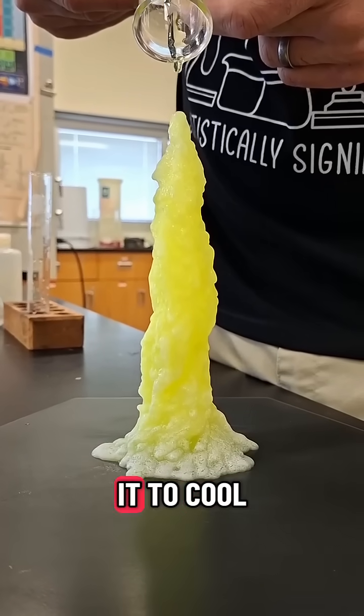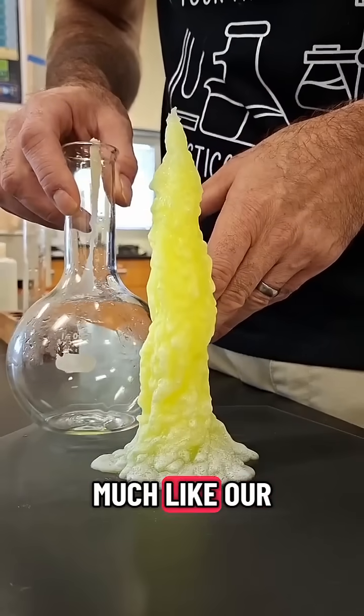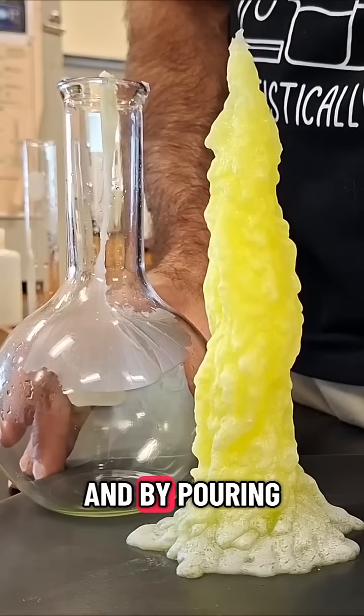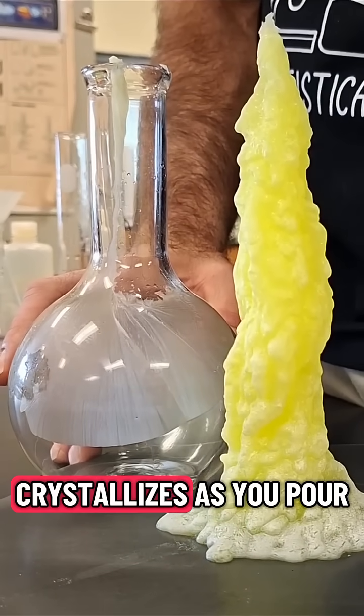And if you're even more careful, you can get it to cool down and stay a liquid. Fortunately for us, much like our membership-slinging friend from earlier, the solution is unstable like this, and by pouring it out onto some seed crystals, it all comes crashing out and crystallizes as you pour.